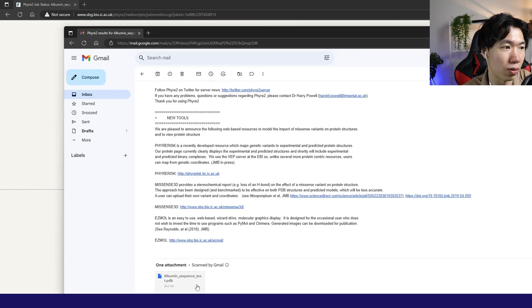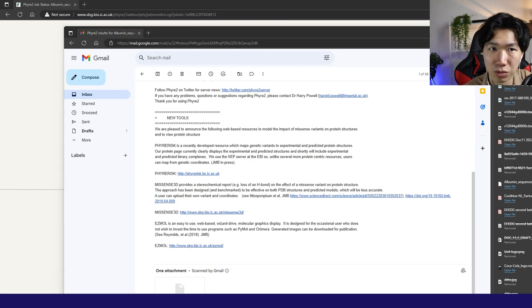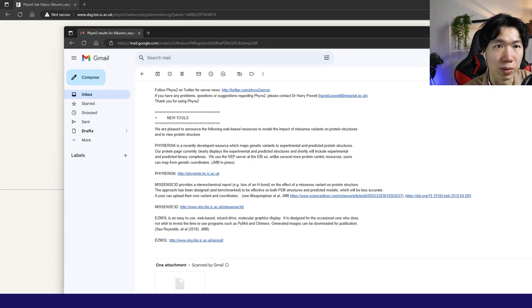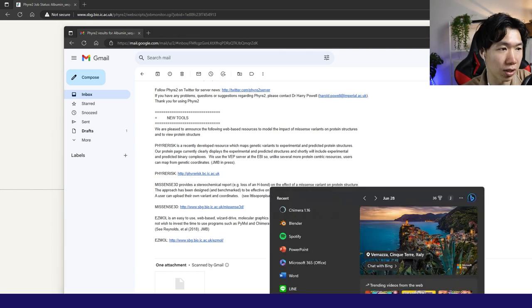And then if you scroll down, you will find this file called the PDB file with the project name that you put in. And we need to find an app to open the PDB file.